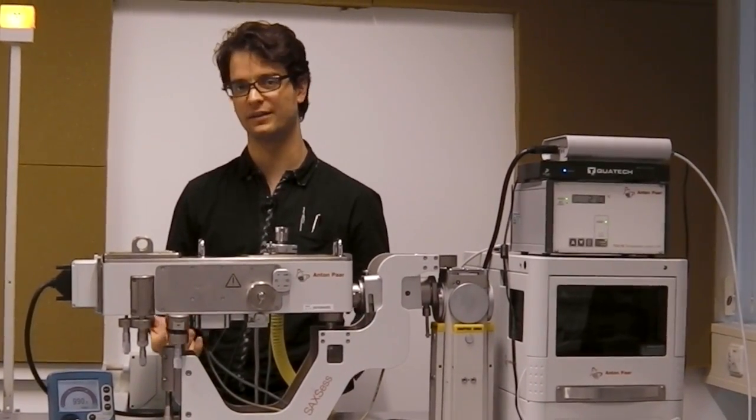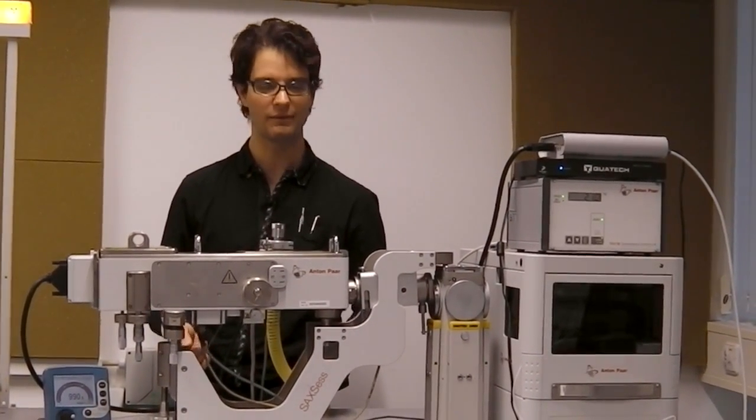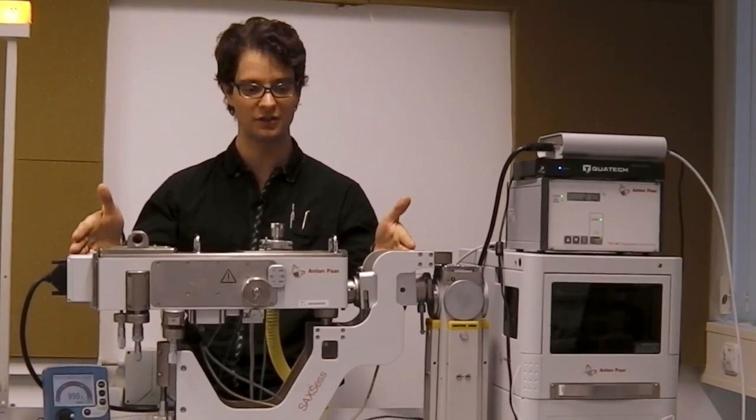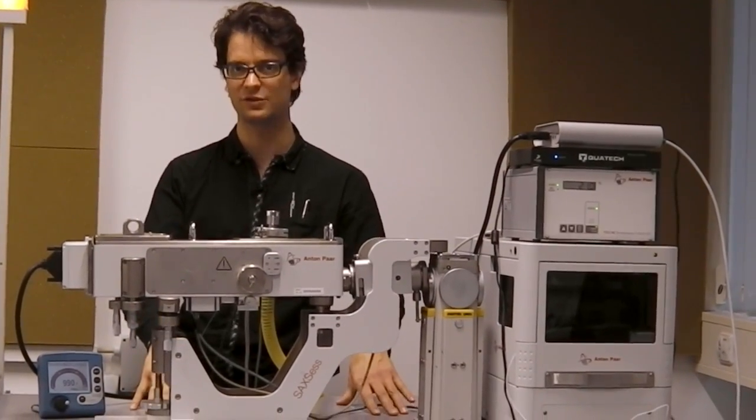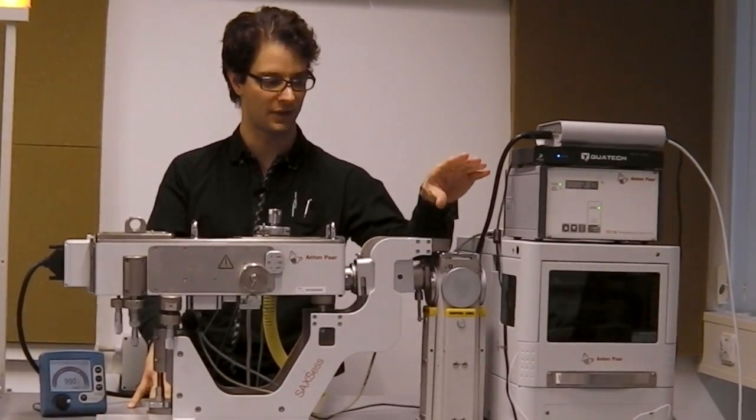This is one of the more compact small angle scattering instruments that we have. It sits on top of an X-ray generator with the X-ray source over here.